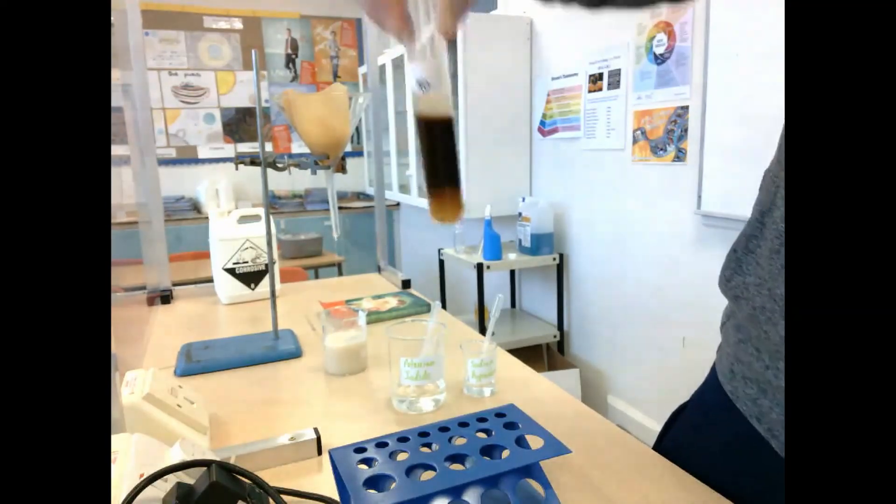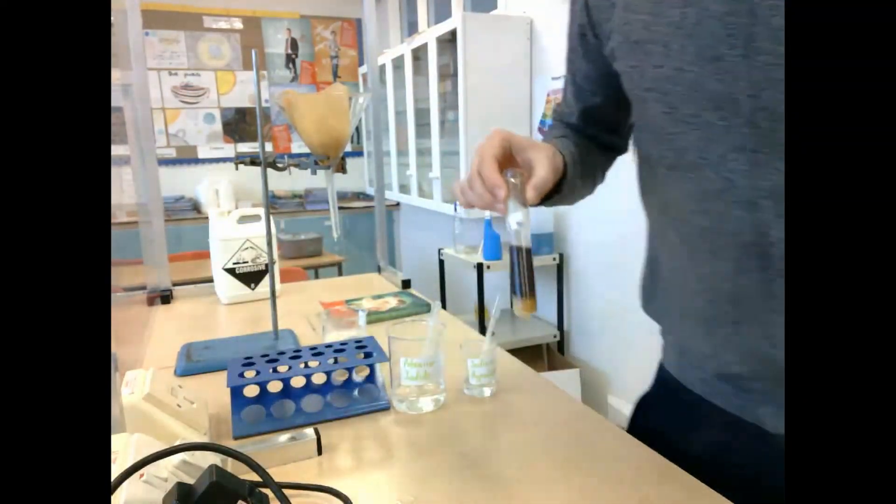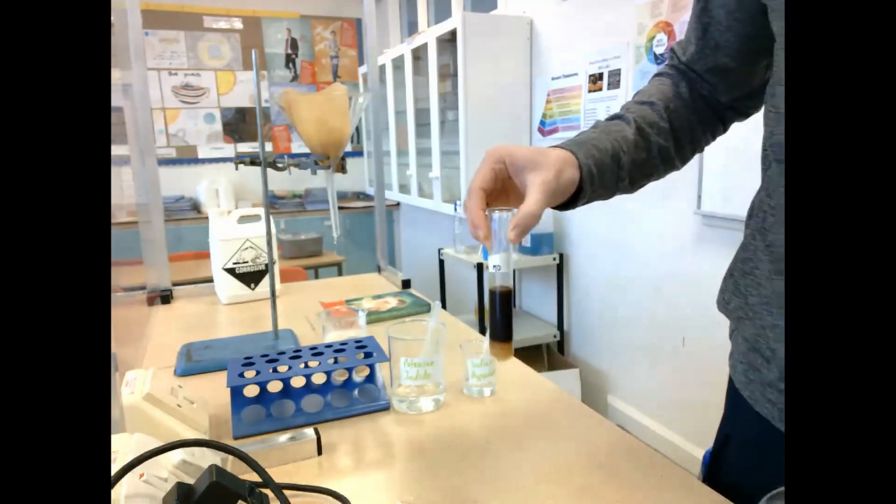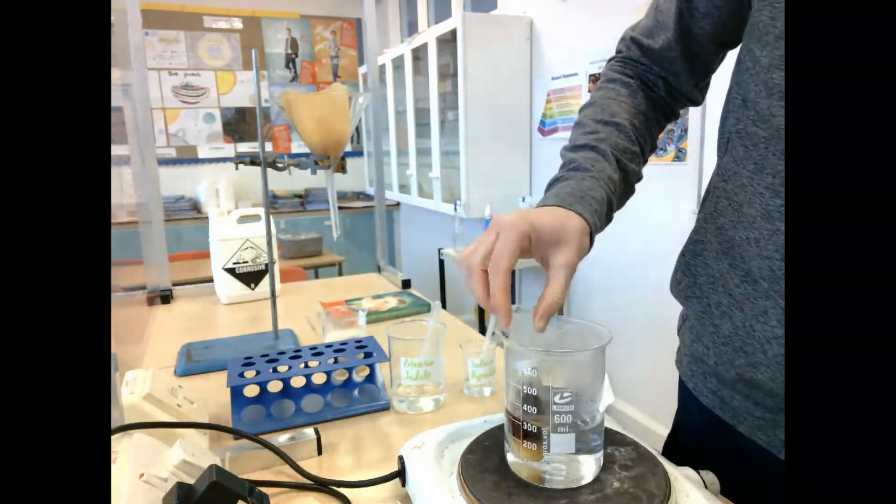So what we then do is we take that test tube and we're going to add it to a nice beaker over a hot plate and we're going to continue to add heat.